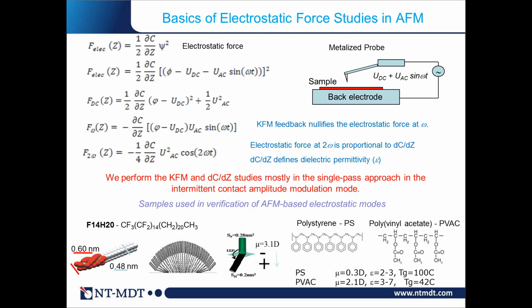Here I just describe what can be done even with traditional microscopy, where people are using Kelvin force microscopy and capacitance measurements to get the electric and dielectric properties of material.